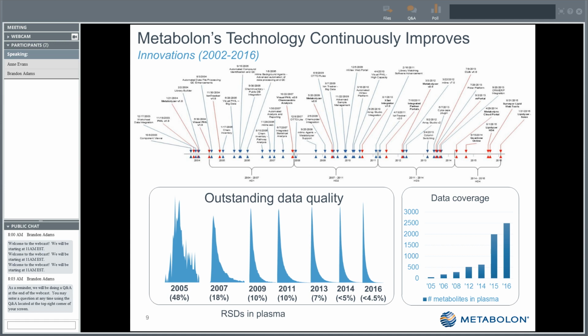And the nice thing about this tracking process is that at any point I can still go in and interrogate exactly what molecule or what classes of molecules are still giving me higher process variability, and then we can make improvements to shift that distribution ever and ever lower.